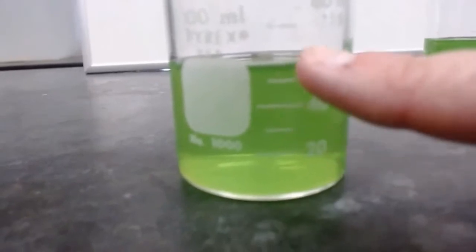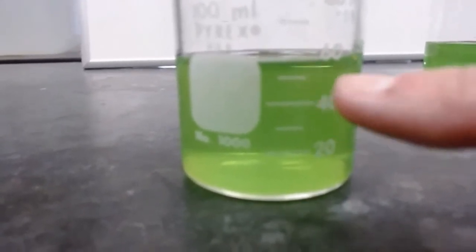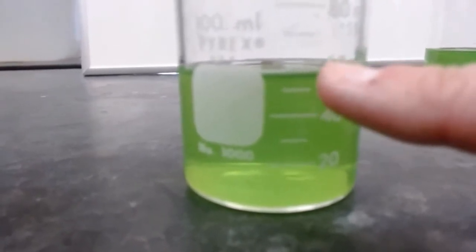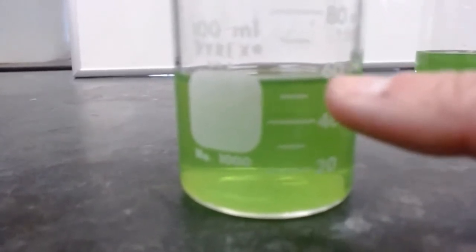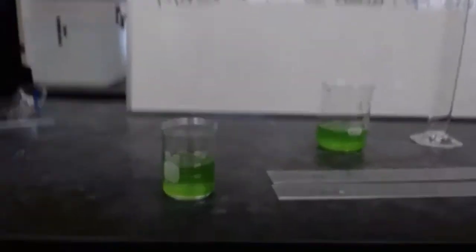So if there is a 40 and a 60 number in a line in between, the line is 50 milliliters. And our green apple volume is between the 50 and the 60. So because there's a line, the line is what we know about this volume. This volume is somewhere between 50 and 60. And so you record that known digit.